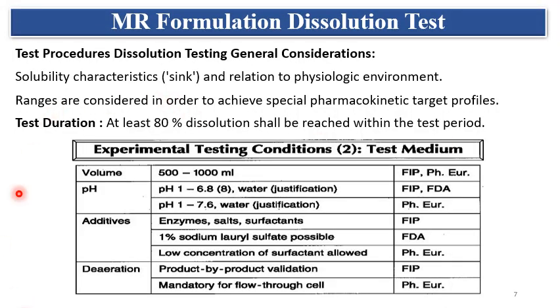Then coming to the dissolution testing. See, dissolution testing is very important to show the in vivo impact and clinical and therapeutic behavior of the MR formulation, because generally the MR formulation contains a higher dose and dissolution becomes much more critical when we compare the MR formulation.